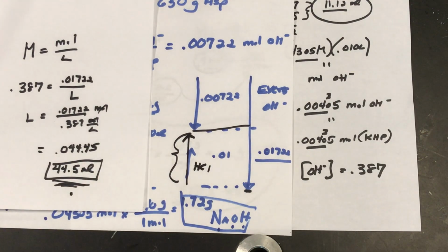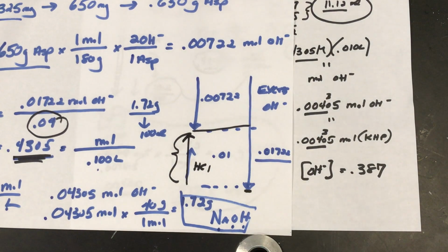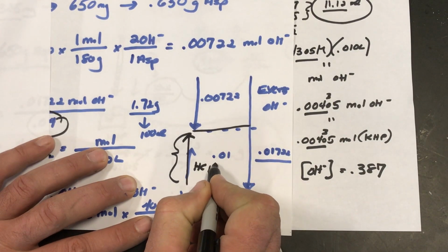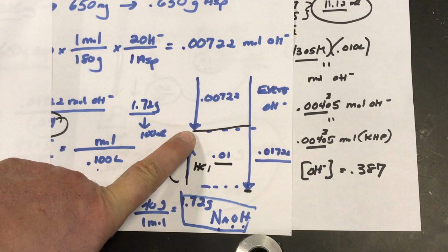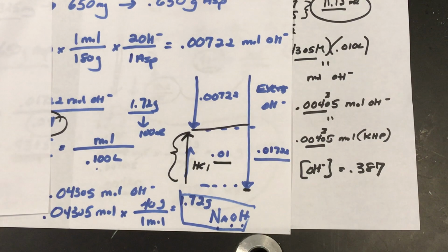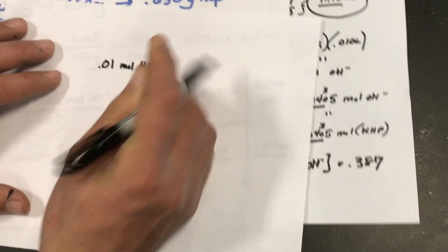So now we have to design a lab. How strong of hydrochloric acid should I make? Okay, but now we need to figure out our solution. Well, we see by an arbitrary decision of student L, she decided that the target means that this is what we expect if the tablets are 325 milligrams each. We've done the stoichiometry. So the excess should be 0.01. So we want to deliver 0.01 moles of H plus.